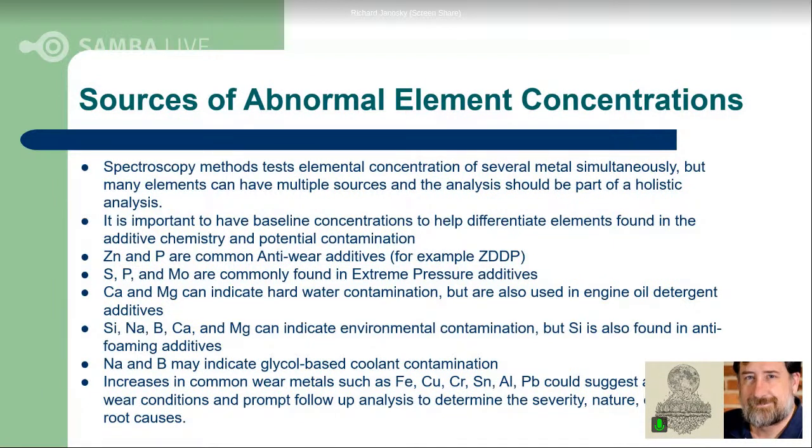Hey, Richard, this is Rich Wurzbach. I'll make a comment on that. So anti-foaming additives, we don't expect to see that in greases, right? But another thing to think about is that there are some clay or bentonite thickened greases, and they will have silicon in there as an element. So when you talked about baselining, it's going to be more about understanding, is this a grease that in its initial formulation maybe has some silicon in it? And if so, we want to account for that and maybe look at a differential between that starting level, like we've seen in some of the bentonite thickened greases, and what we see from a used sample.